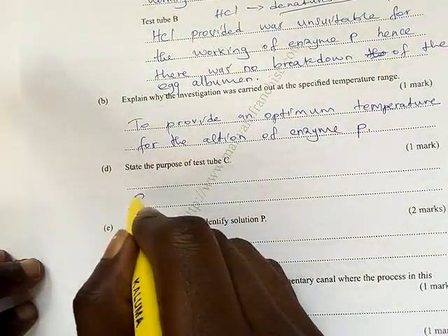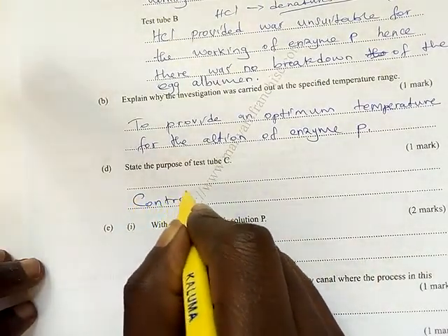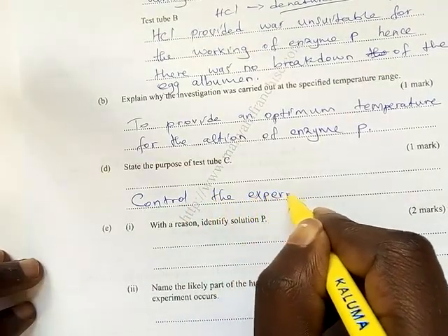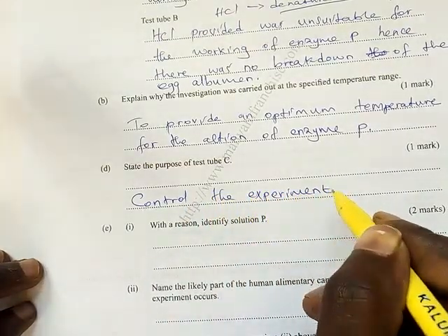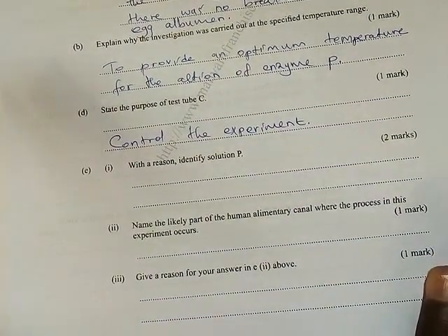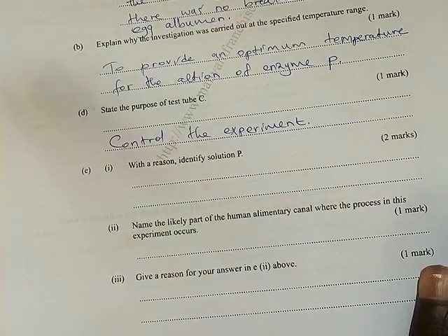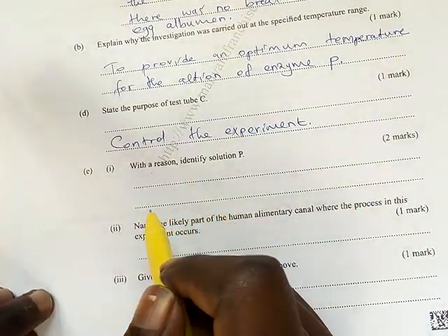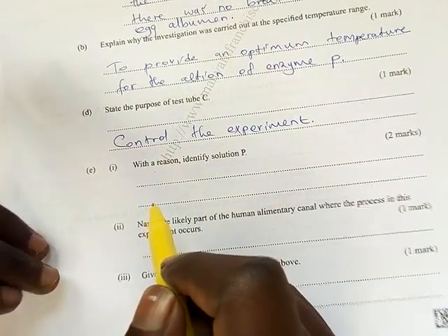That was only to control the experiment. In test tube C we added only water, to control the experiment.